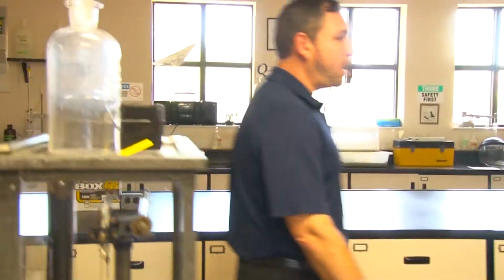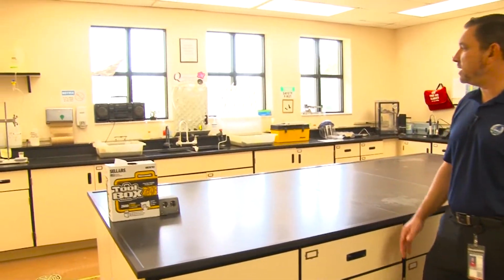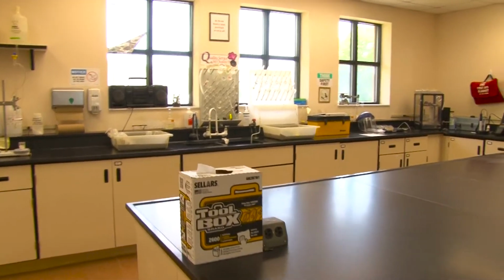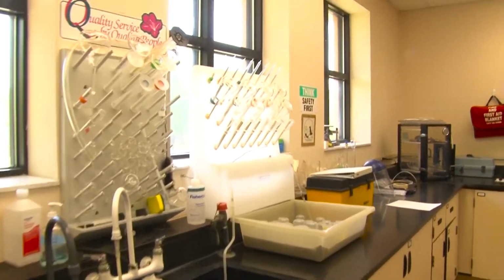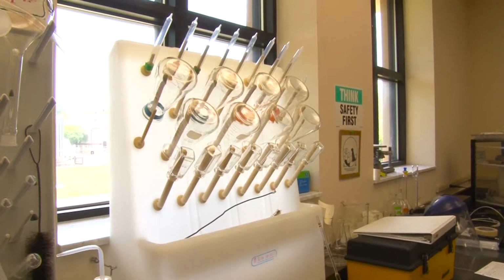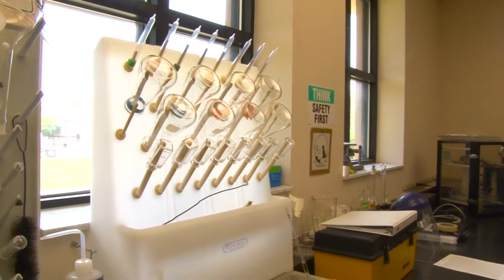This is our lab part, and this is where they do all their process control. And you can see all the beakers and all the instruments we have here at the water lab. And the 2 guys, Brian and Steve, come out here every morning and do process, and they check pH and color and turbidity, everything that pertains to the water treatment plant providing safe water to the citizens of Valdosta. This is where they do this every morning.